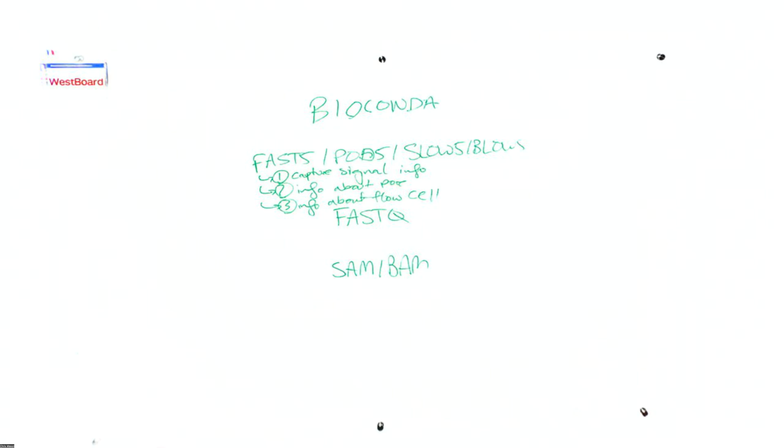And Nanopore makes updates to the parameters and configurations of their flow cells consistently. So it's good to have this information for when you're potentially aggregating meta-analyses across samples. And we'll talk about next week, but RNA sequencing is slower, like 120 bases per second versus 450, which adds a big factor in how fast it goes. I'll make sure to talk about that. And that's something that, yeah, is captured within these formats.